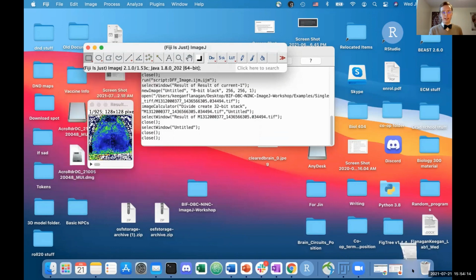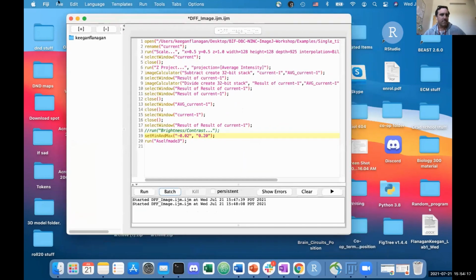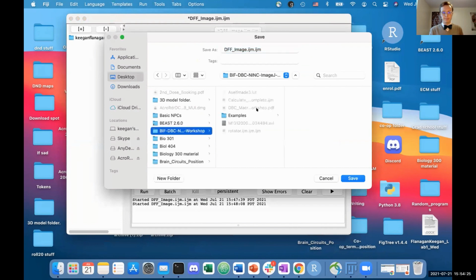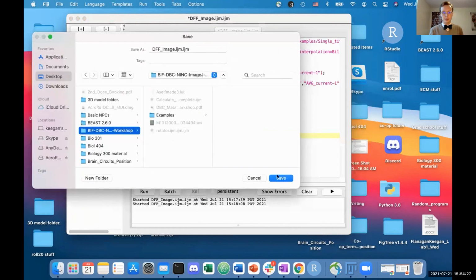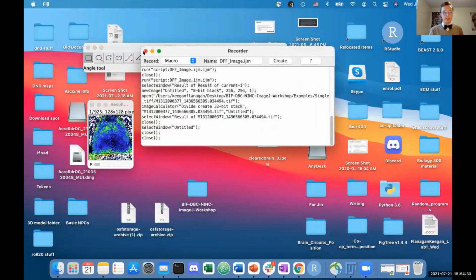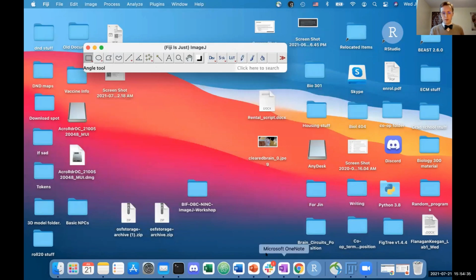And one last thing for this is I'm just going to save it within my workshop folder. There we go. All right. Now I'm going to go back to the slides.